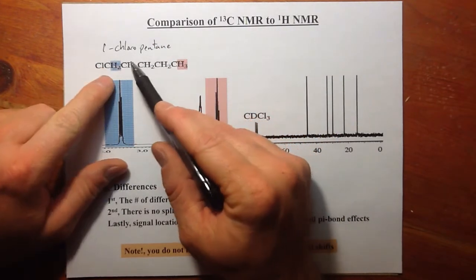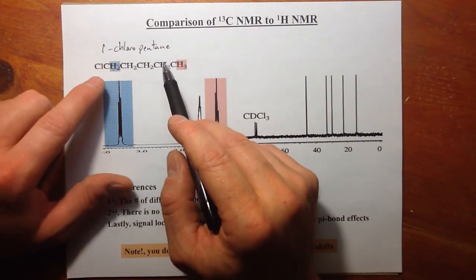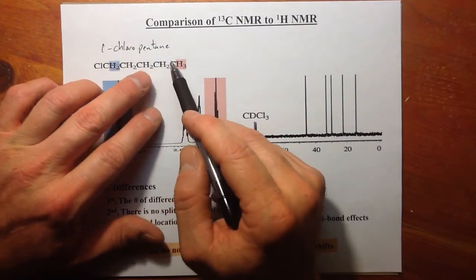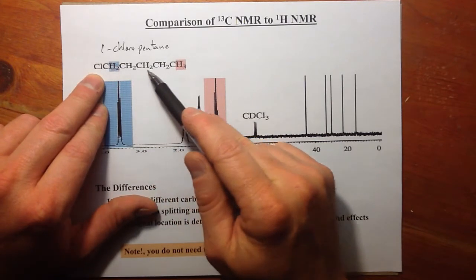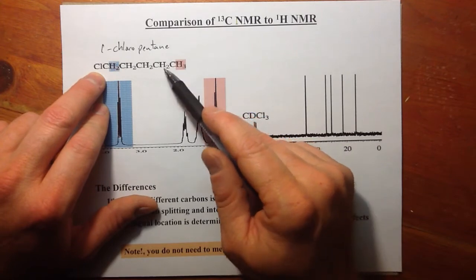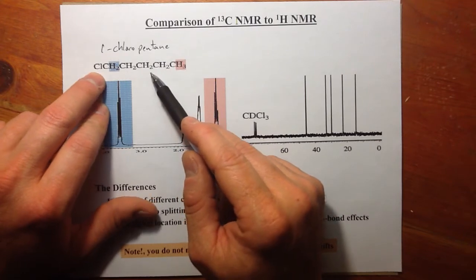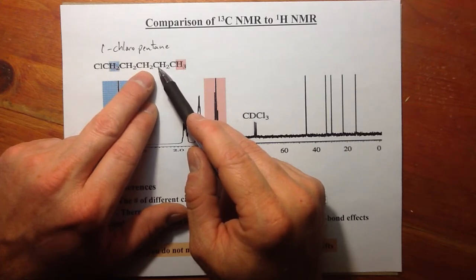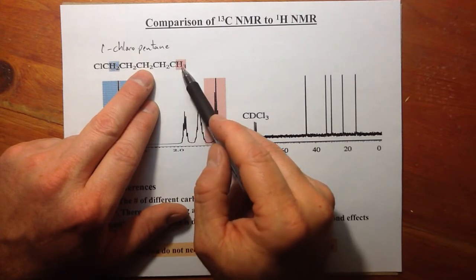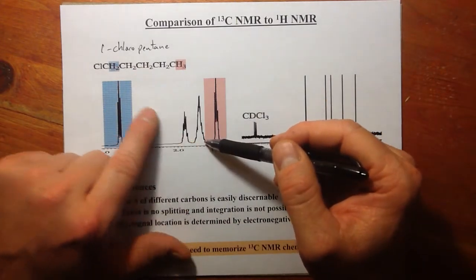And just as a quick review, you know that these carbons are not chemically equivalent, though they'd be very, very similar on this tail end as far as their properties. Alkanes far away from this halogen by inductive effects just can't reach out and affect or influence this end. These would be very, very similar over in this region as far as chemical properties. Magnetically, these would be very, very hard to resolve by NMR because they are interior alkyl groups. At least the terminals tend to be a little bit below 1 in NMR, but these would be falling on top of each other. And we sort of see that in the NMR with proton NMR.